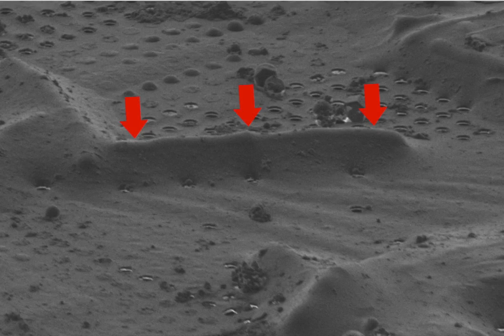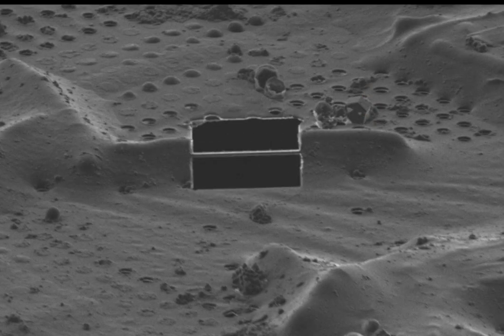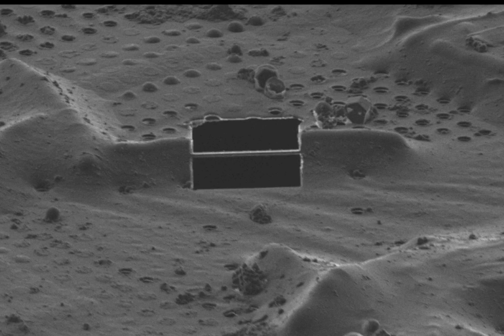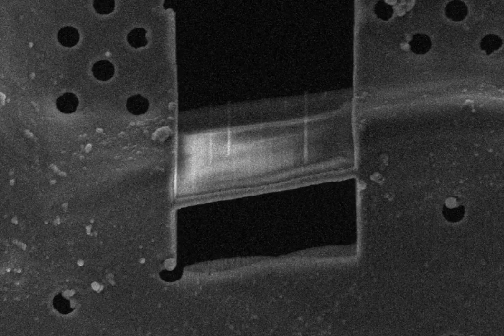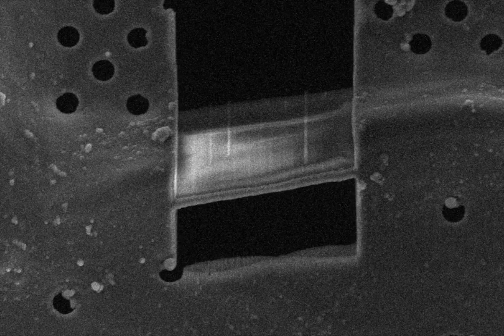Individual S. pombe cells were identified on the grid surface, and from a low angle of incidence they were iteratively milled using a focused gallium ion beam into a thin lamella. Samples containing cryo-FIB milled lamellae through dividing cells were then transferred to the cryo-electron microscope for tomographic data collection.